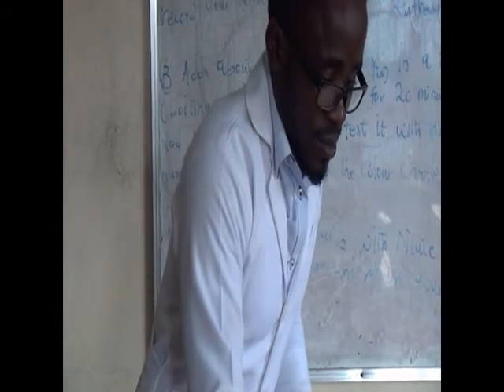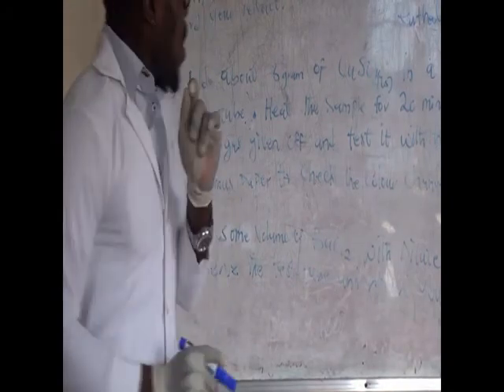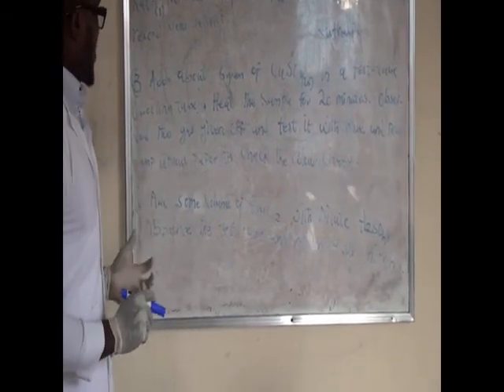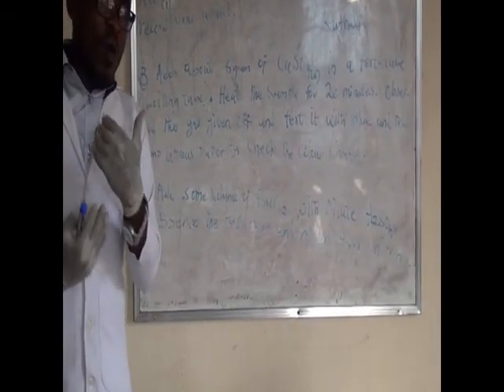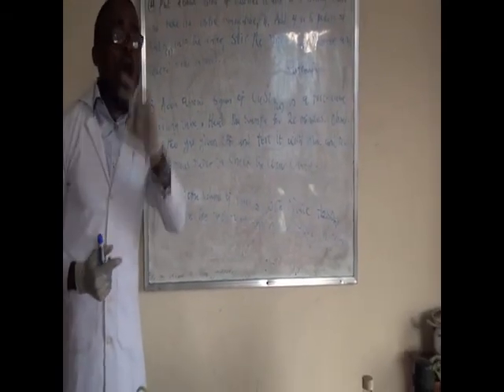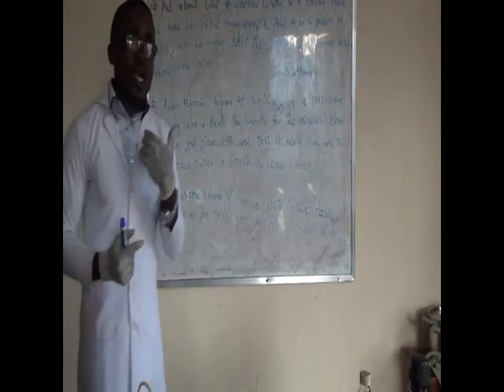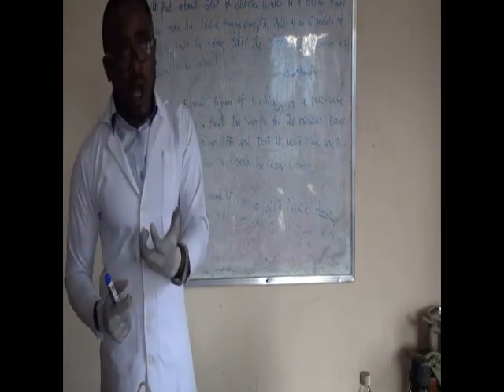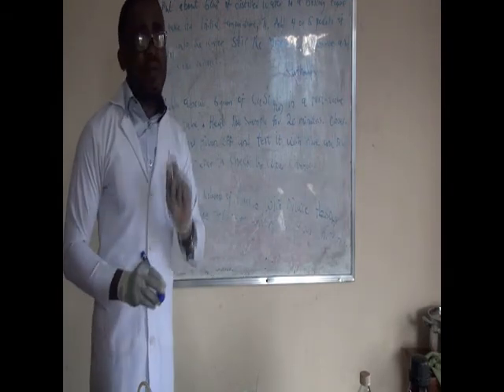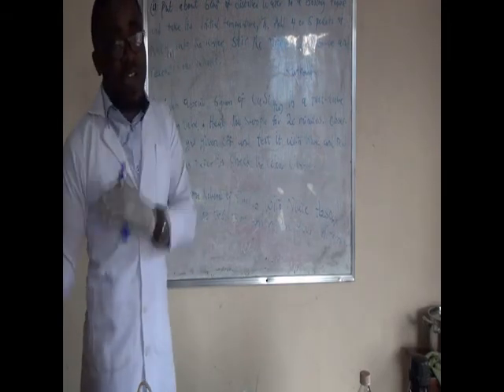Now we've performed the practical aspects of this copper sulfate, 5 grams being heated for 20 minutes, and we observed that at the bottom of the test tube, the color changes from blue to gray or white, indicating that the gas is given off and also the cupric sulfate, which is blue in color, has completely changed. Now, what is the chemical reaction, or the balancing of the chemical equation, involving this color change?